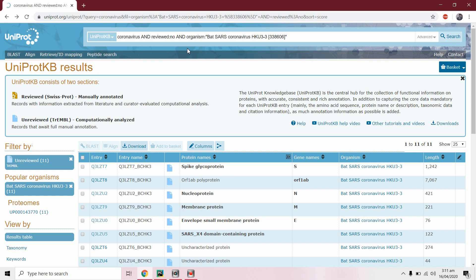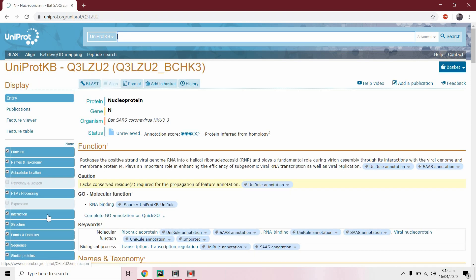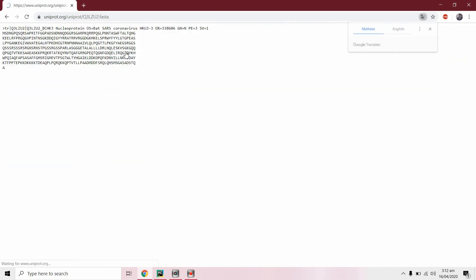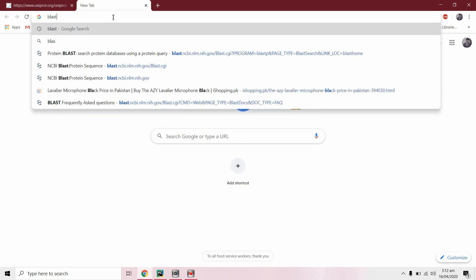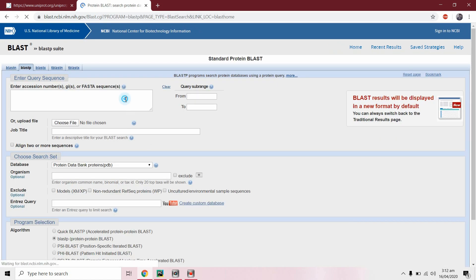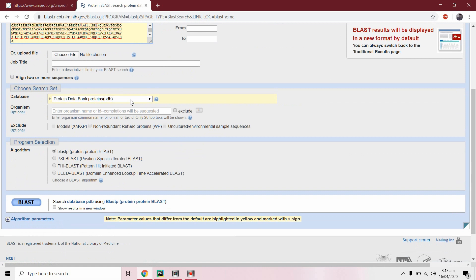In this video tutorial we are going to use coronavirus protein and predict its three-dimensional structure using MODELLER. We use a nucleocapsid protein sequence in FASTA format. First we will search its template from the PDB database, copy this sequence, and search its template using BLAST — Basic Local Alignment Search Tool. We will use Protein BLAST, paste the sequence, and select the Protein Data Bank (PDB) option, then hit BLAST.